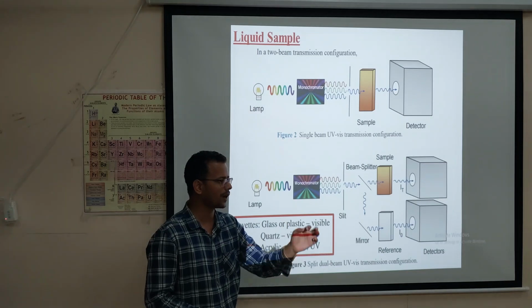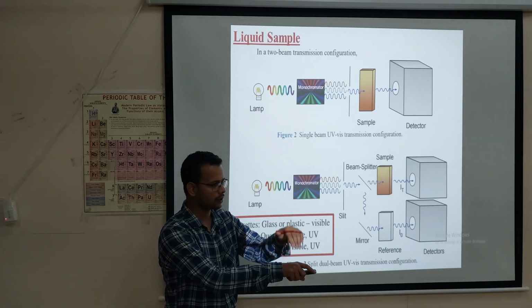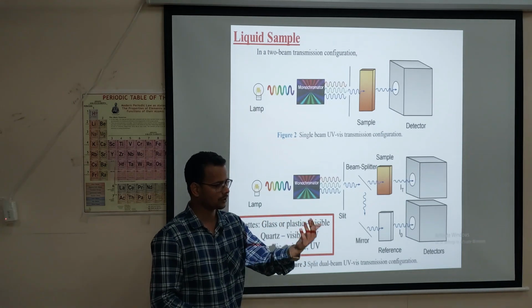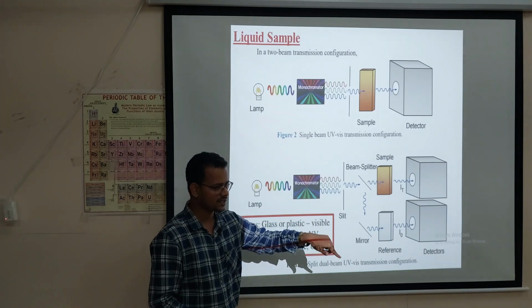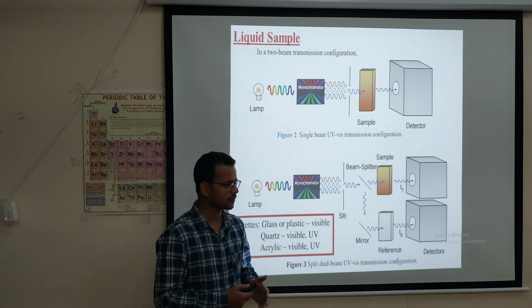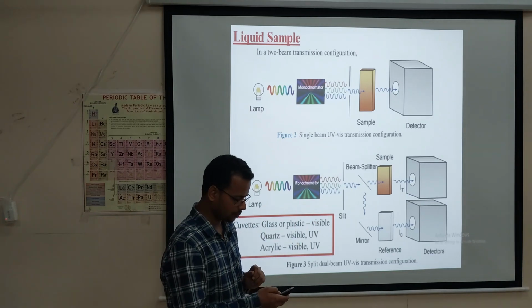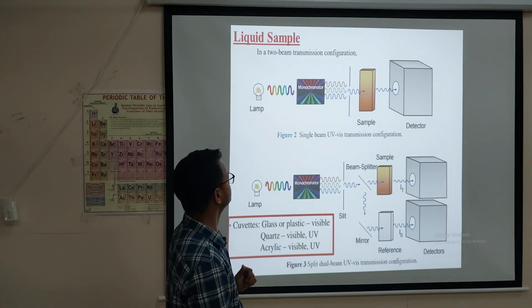Suppose I take 1 drop of ink in water, then I put 2 drops of ink, 5 drops, 10 drops. So when concentration increases, light absorbance also simultaneously increases, right or not? Yes. So on that basis we can calculate the concentration of our solution. Clear? It is a quantitative measurement. We will move to the next slide, or have a doubt? Okay, clear?